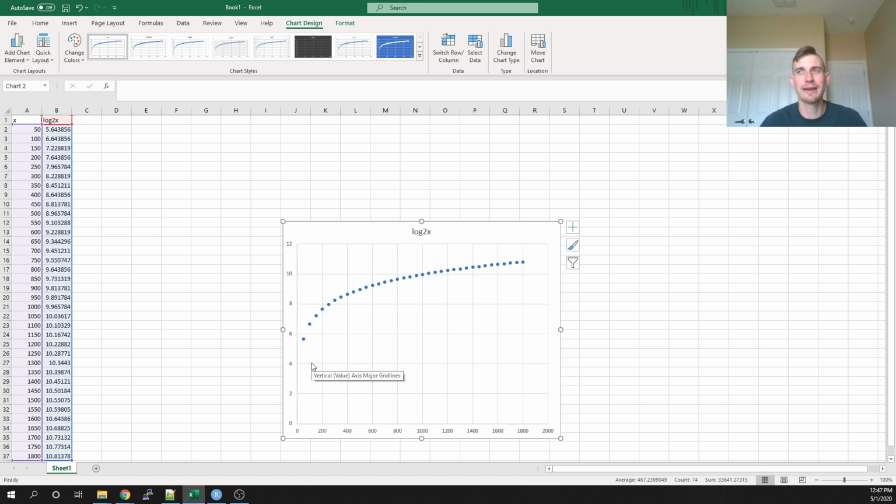It makes our values much more comparable and easier to look at, and also puts everything more or less on the same scale, so that a change from 3 to 5 would be the same change as going from 30 to 50, and the same change as going from 300 to 500, 3,000 to 5,000, etc. These orders of magnitude become much more similar to each other.